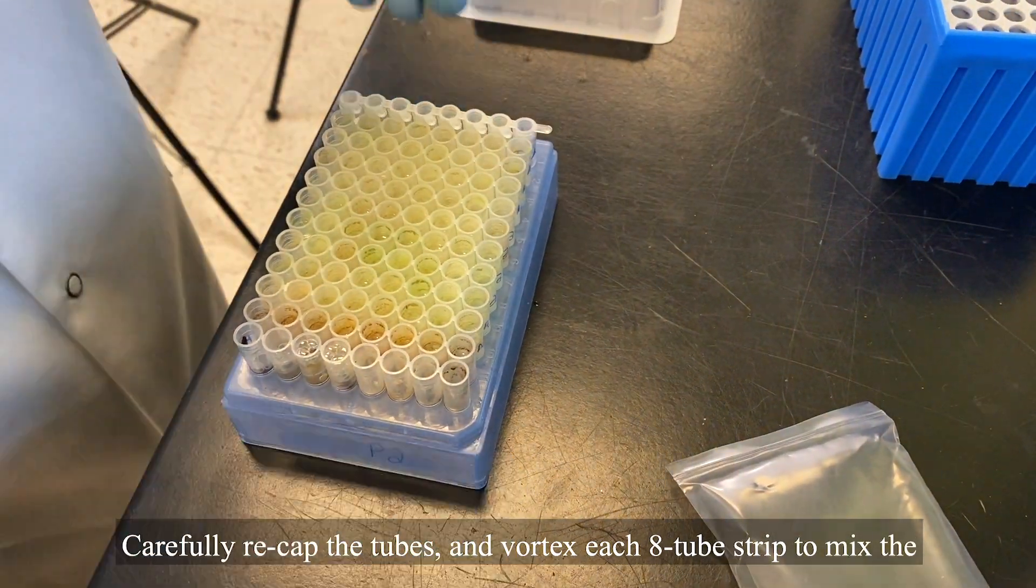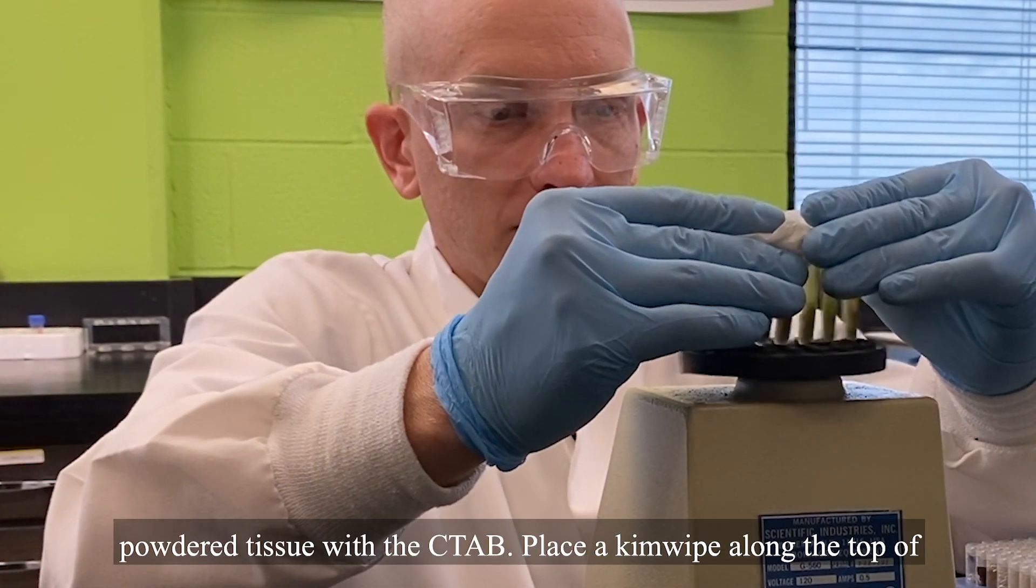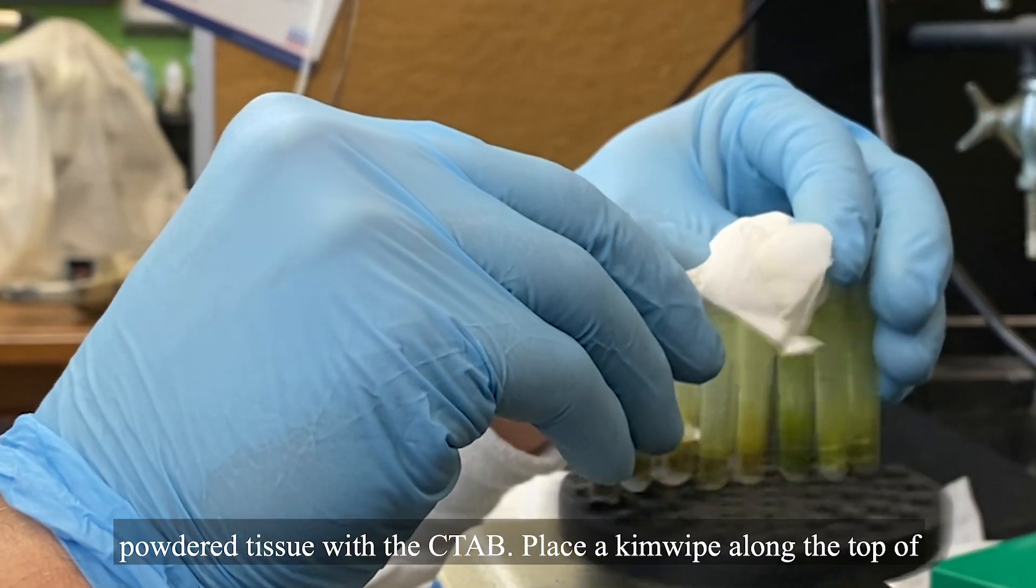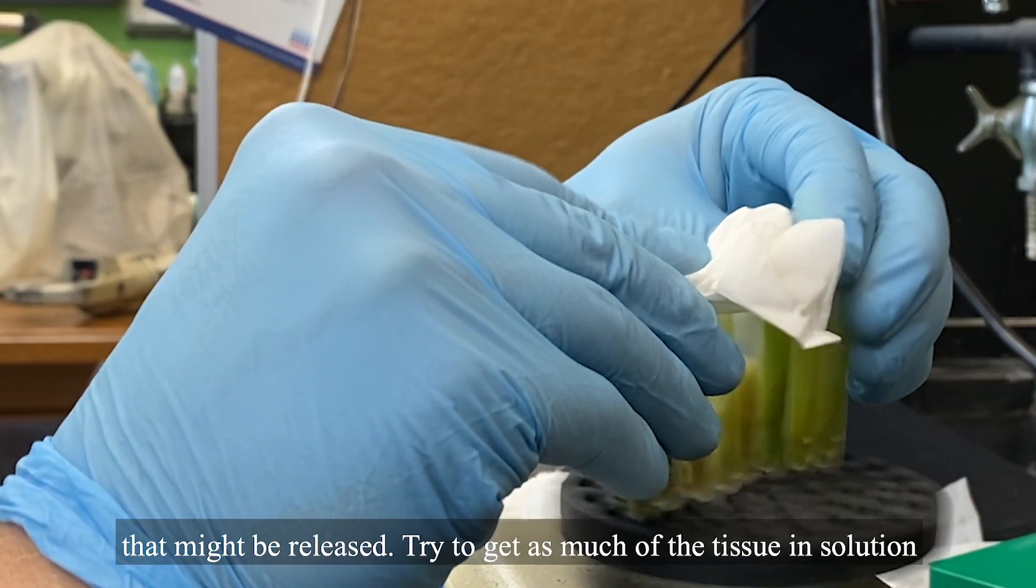Carefully recap the tubes and vortex each 8-tube strip to mix the powdered tissue with the CTAB. Place a chem wipe along the top of each H strip during vortexing in order to capture any excess liquid that might be released.